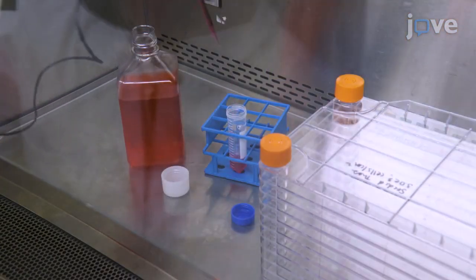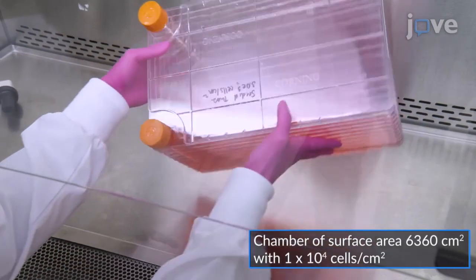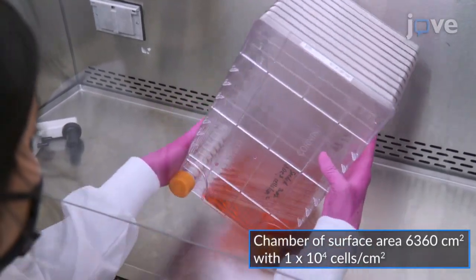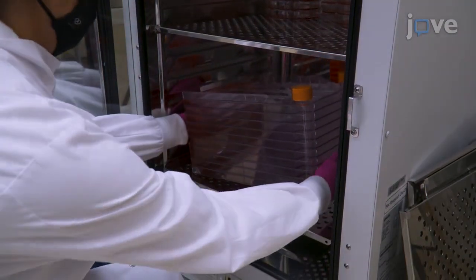Mix the cell suspension with 1 liter of pre-warmed complete DMEM to seed the culture chamber. Gently rotate the chamber to distribute the cells evenly. Incubate the chamber at 37 degrees Celsius with 5% carbon dioxide.